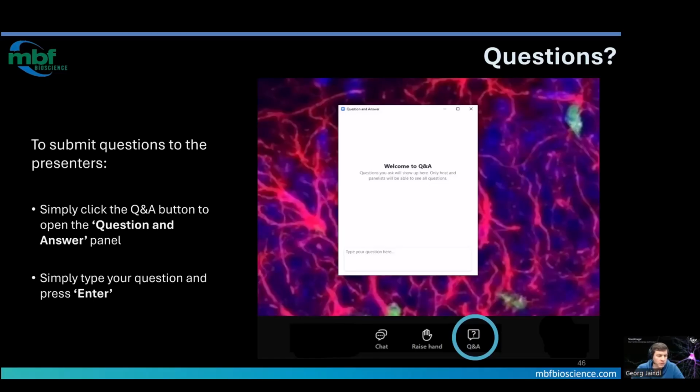There's a question, is it possible to pin previously acquired images to the background before starting a new mosaic scan? For example, to perform an alignment to re-image the same spot? And the answer is yes. You can do that, of course. Anything that you pin to the background stays there until you clear it. If you have a background pinned, you can save that background out into files and then in the next session, the next day, for instance, load that background back in and also align the background to the current imaging session. There's a special alignment tool that Mitchell implemented for that.